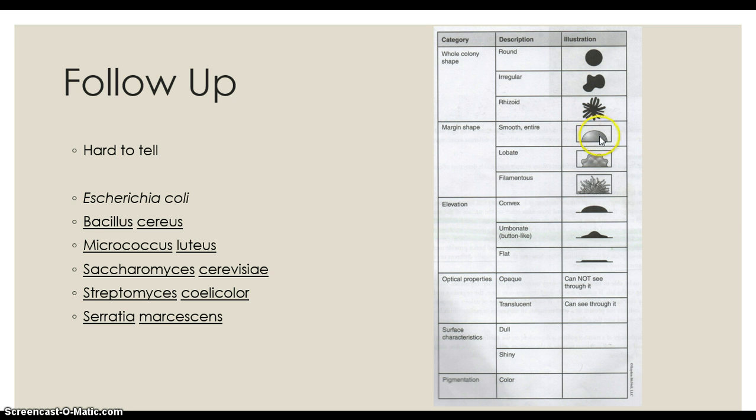Okay, the margin shape can get tricky because that's probably the hardest one for me. I don't really know what to tell you. Try to ask someone, maybe, to figure out how to tell, distinguish these. I don't know. Elevation ones, those can get kind of tricky too because these umbilicate ones, sometimes this little bump right here is very, almost looks flat. And so, or it may be really big to where it looks convex. And it doesn't necessarily look distinct. Just try to find in your culture a good representative sample and then do your best.